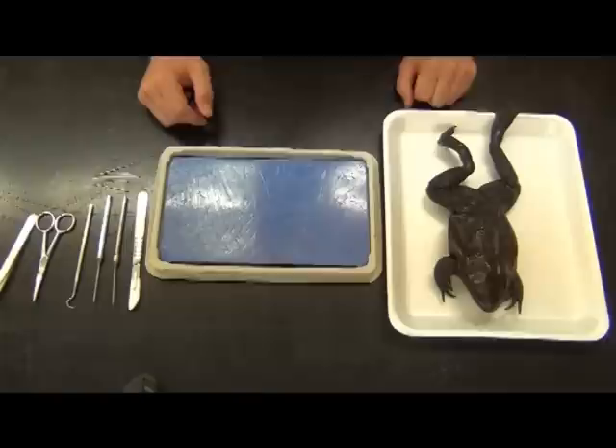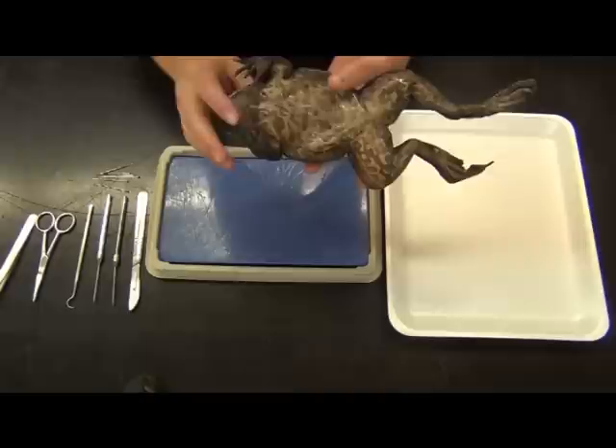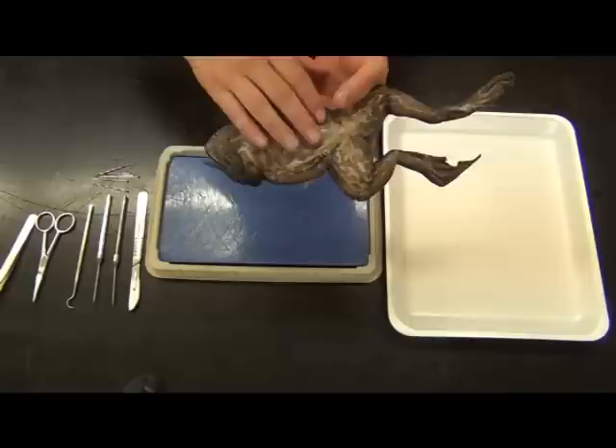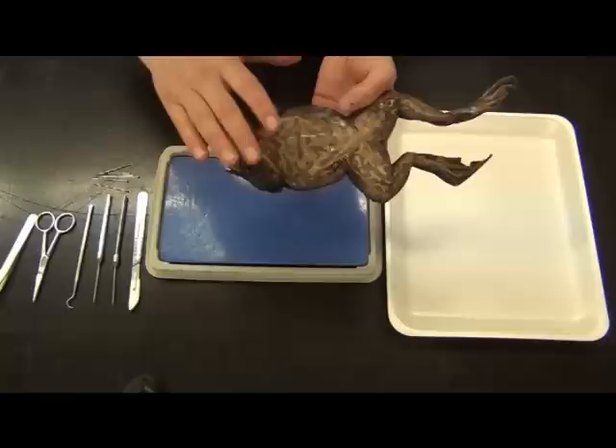We have a fairly standard bullfrog, about a foot long — you can pick these up at just about any scientific supply. Knowing if they're male or female just by looking externally: males usually have a larger pad on the front legs, though you usually need several frogs to compare. A good indicator of a female is a very distended belly — if they have lots of eggs inside, the skin is usually protruding and solid, and you'll find just a mass of thousands of tiny eggs. Today I believe it's a male; we'll find out in just a moment.